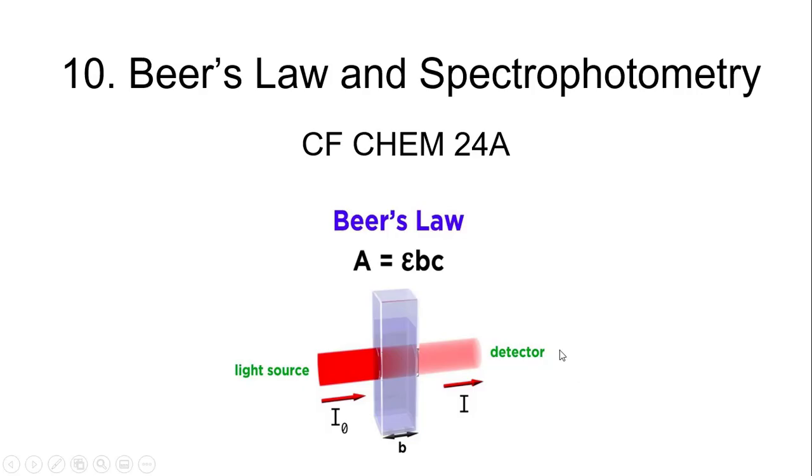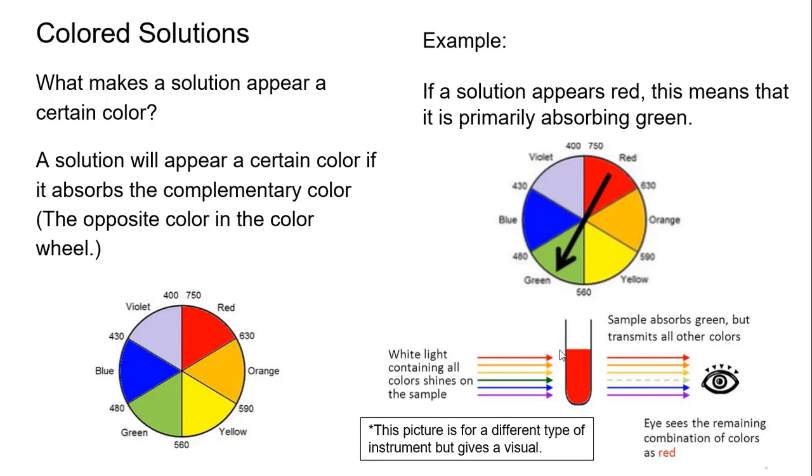Hi class, today I'll be covering Lab 10, which is Beer's Law and Spectrophotometry. So let's get started. The easiest way to explain this slide is to look at the example first.